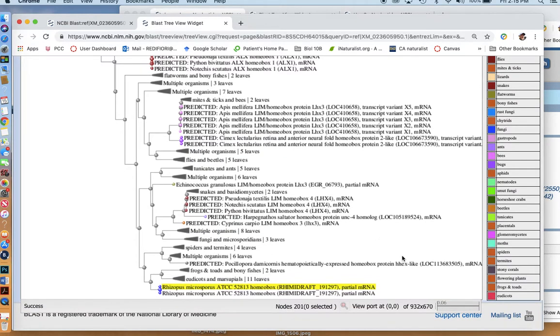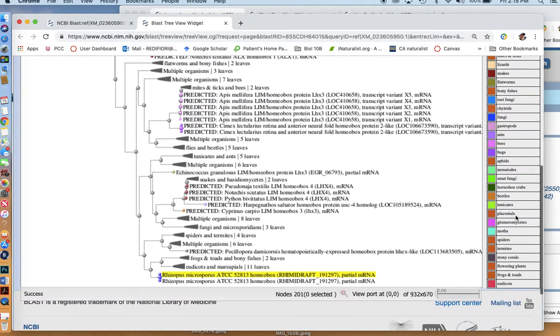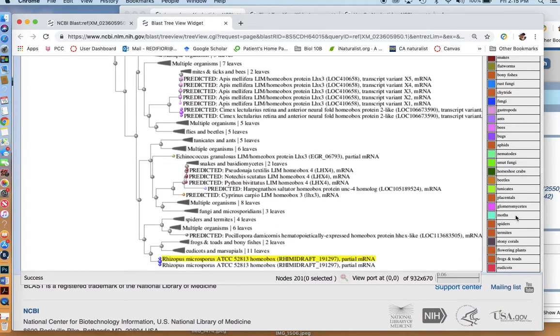But I also notice there are members of all kinds of other groups. The kingdom fungi is included. This is a fungus sequence. And even some plants, which is really kind of odd, kind of indicating that this is a really early sequence.